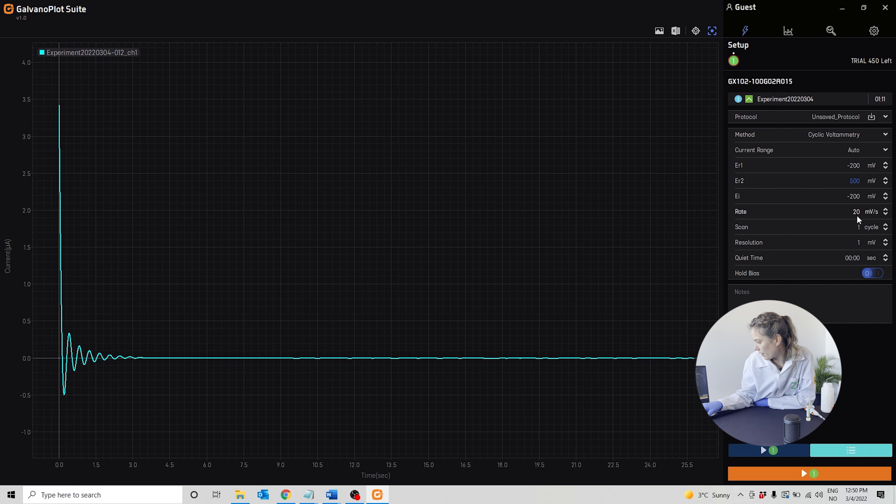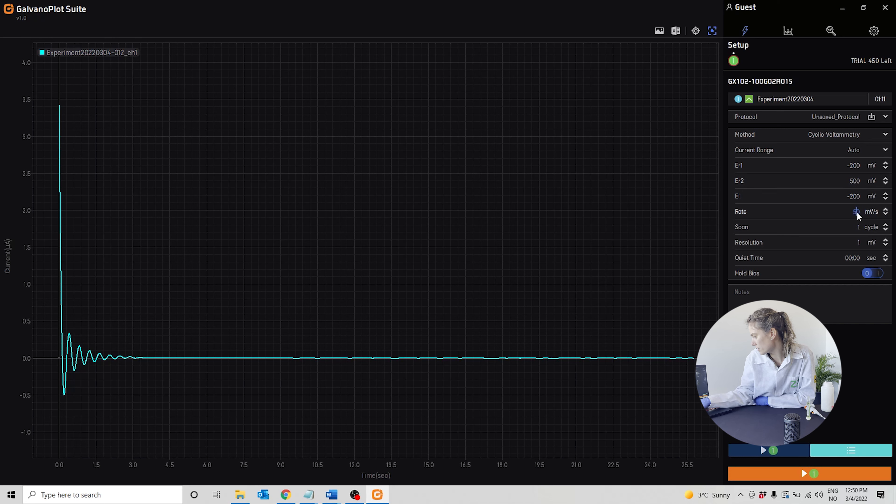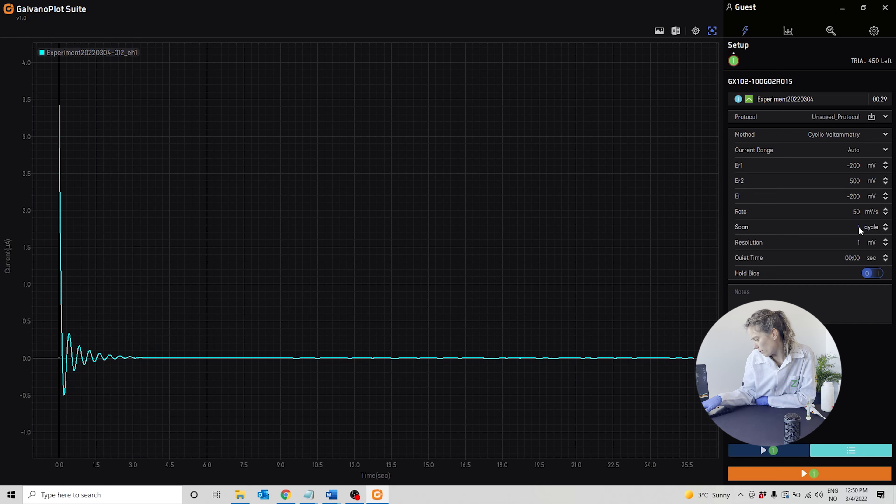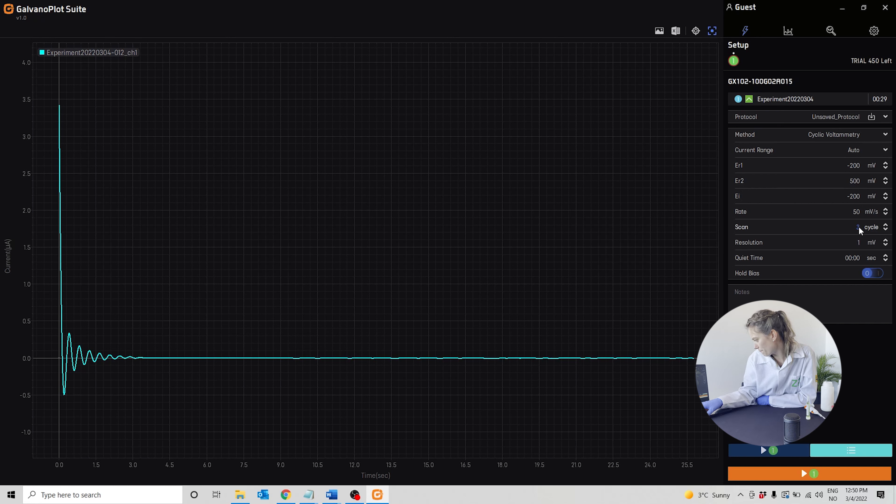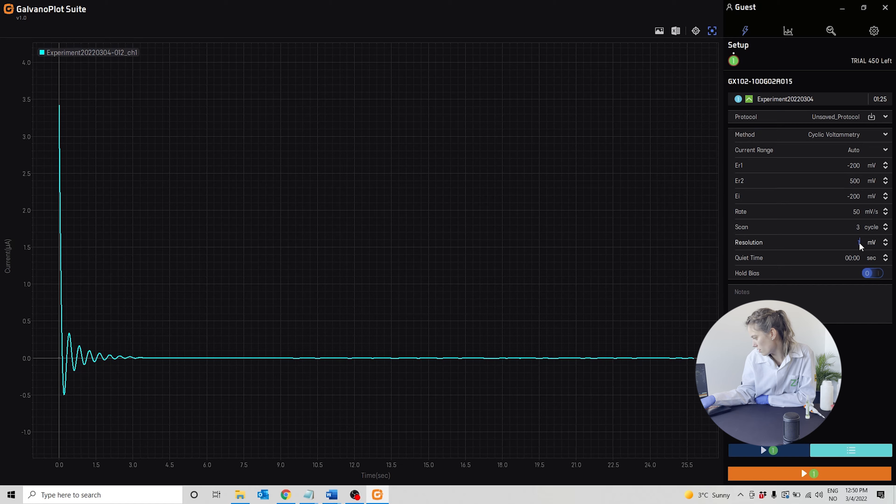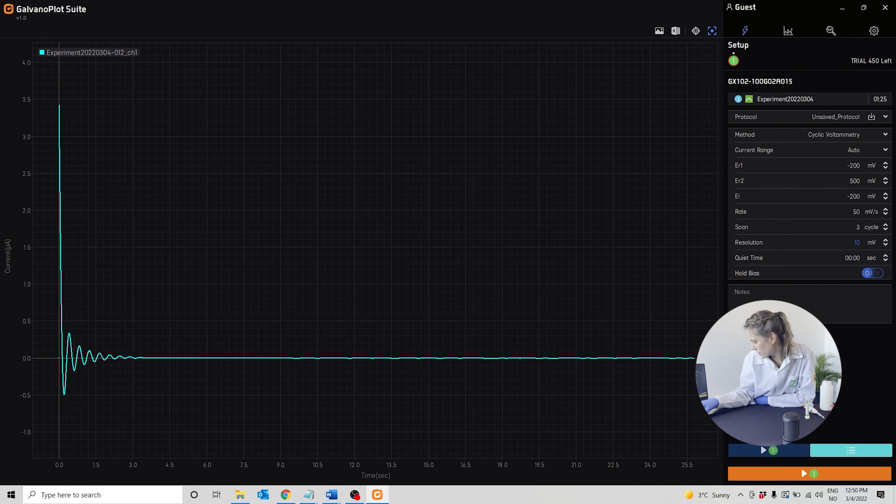The scan rate we will use is 50 millivolts per second. We will run three cycles, and the resolution will be 10 millivolts.